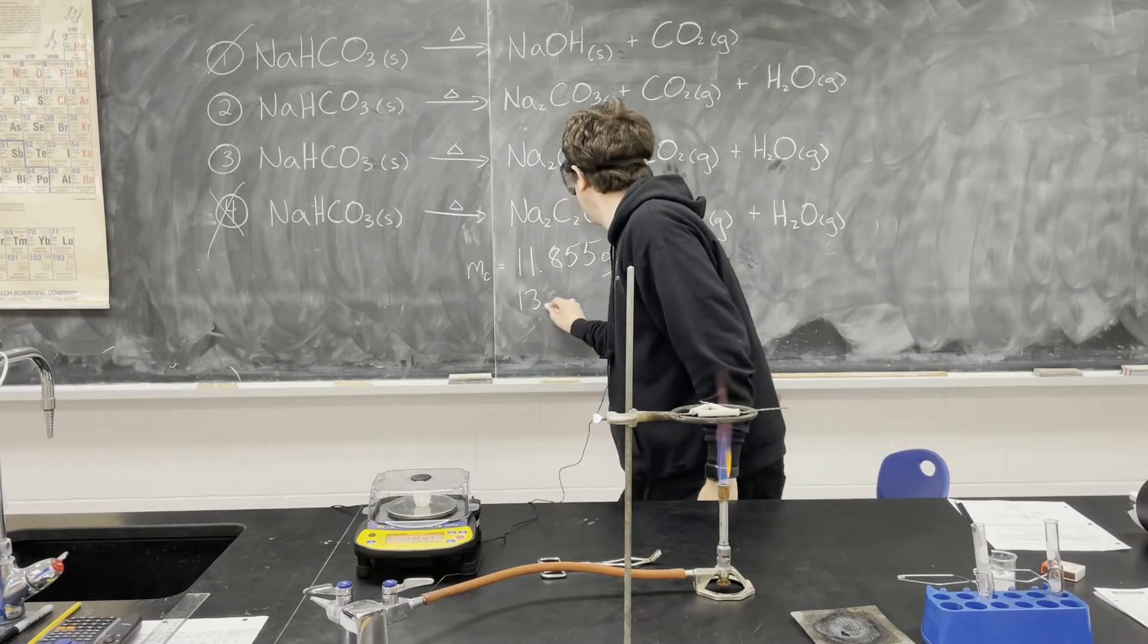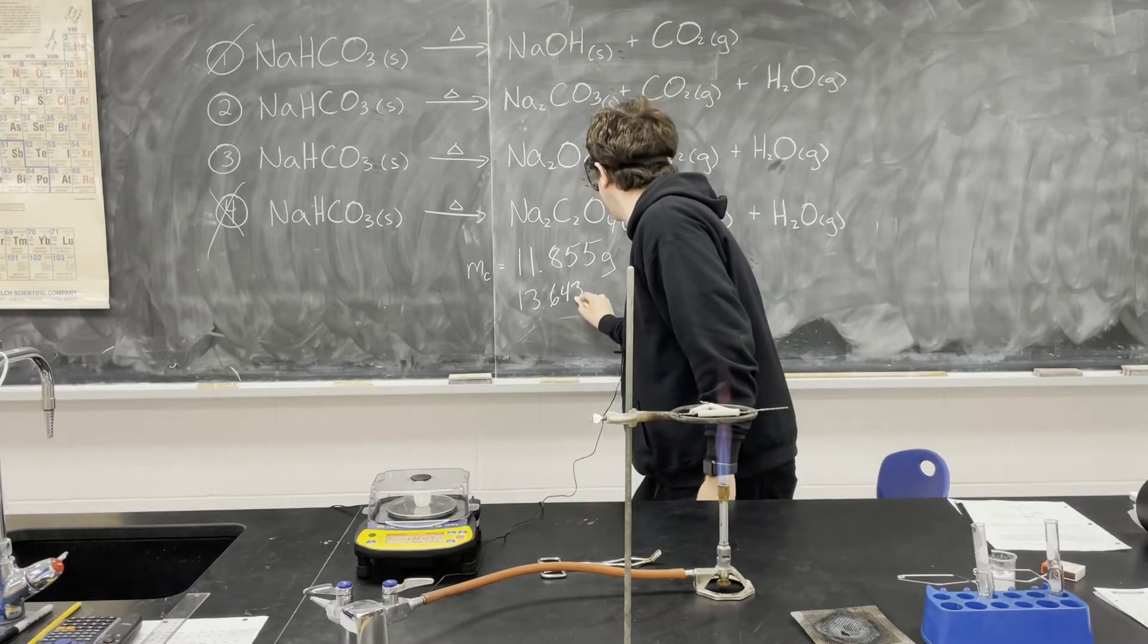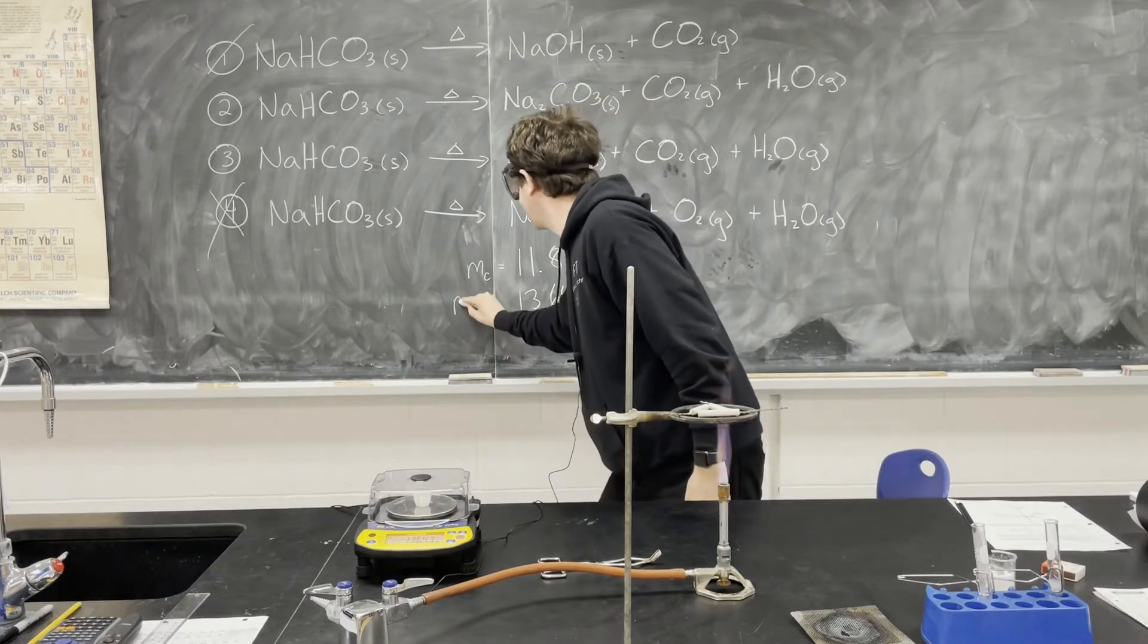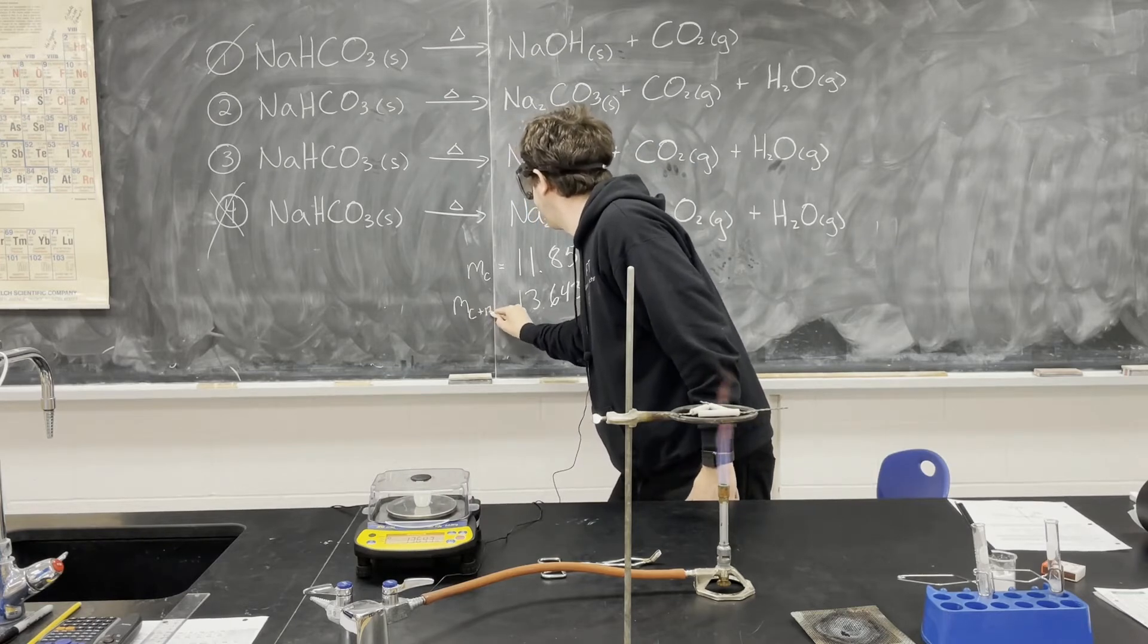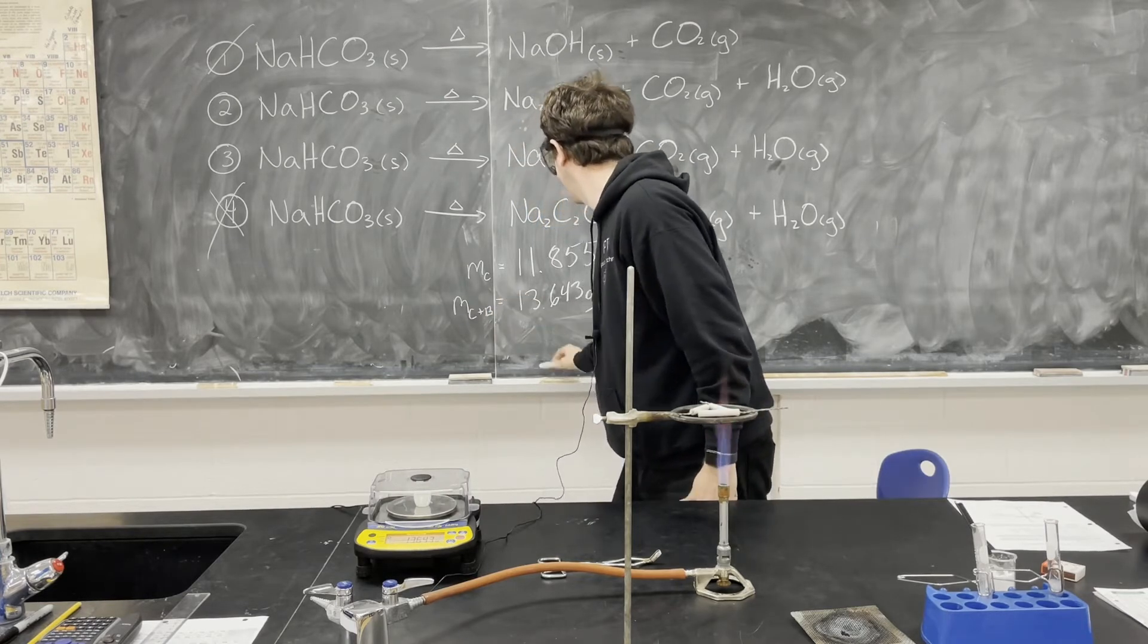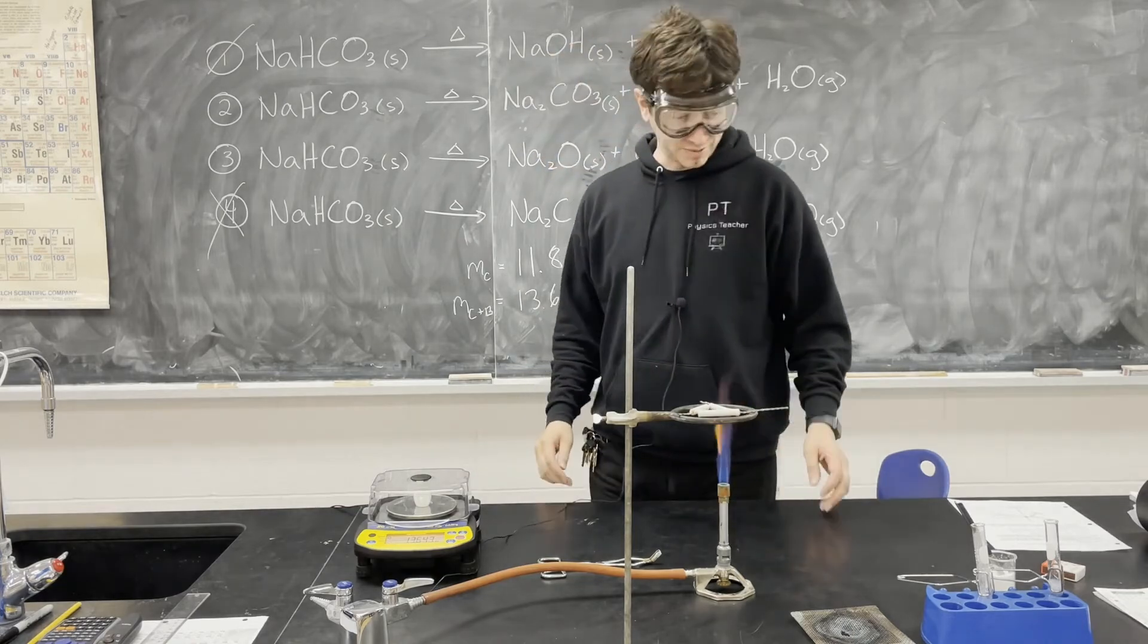So, 13.643 grams is the mass of the crucible and our baking soda. All right, now we need to react it.